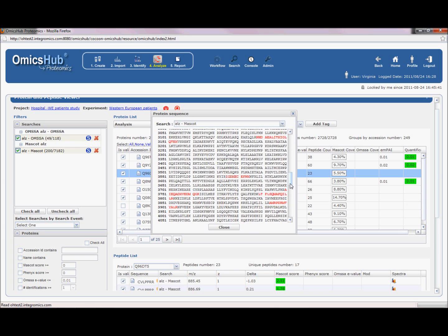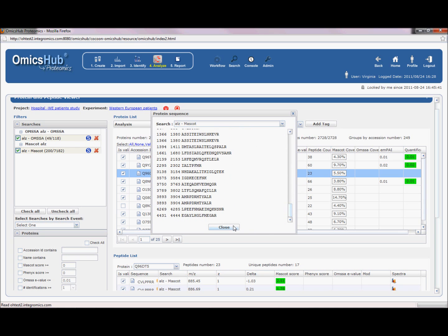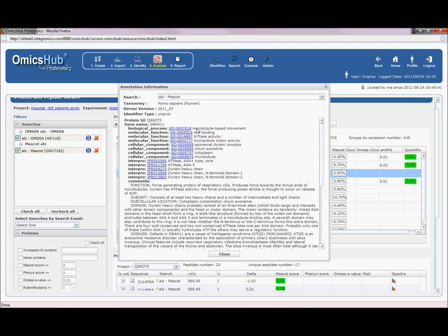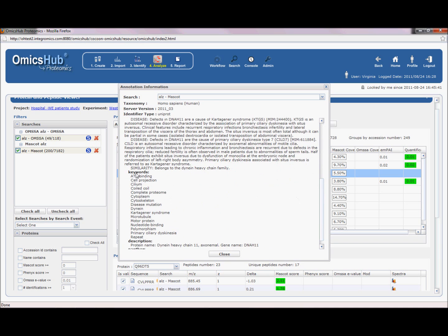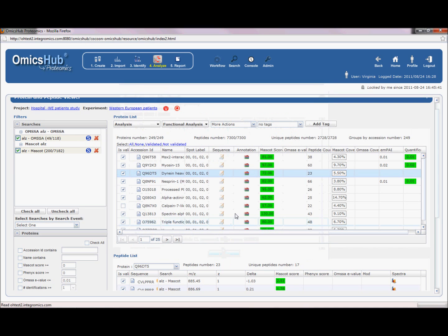You have the annotations, so all the available information is summarized in here. You also have the links in case you want to know further about them. The keywords are in here, etc. Again, you don't need to memorize or copy anything because this information is going to be in the final report.